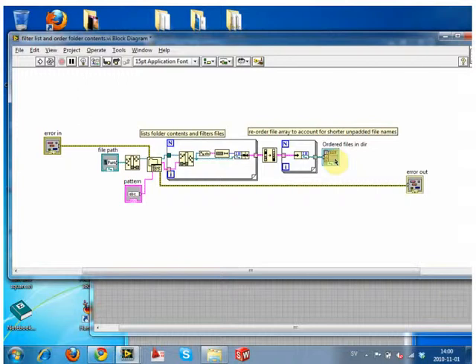0001. And equally, lots of times the file numbers, depending on how they're written, aren't always a contiguous sequence. Maybe you've got files 1, 4, 7. Maybe they're incremented by a different number. Sometimes they're attached to a millisecond value instead of an actual file number. It's like what millisecond it was on when it recorded that image. So it might not be a regular sequence. But when we read it in, once it's ordered, we can give it a regular sequence name. We don't have to keep the original file names. We can just make our own up. And then we can zero pad them the right way. We can make them a more universal file name and file structure. So that we can do quite easily.